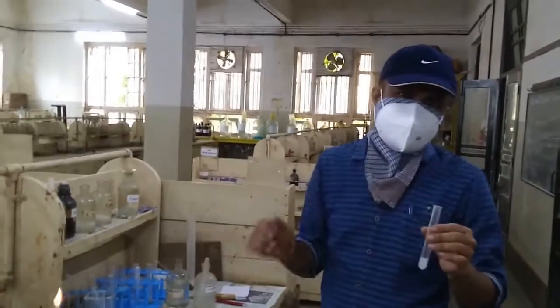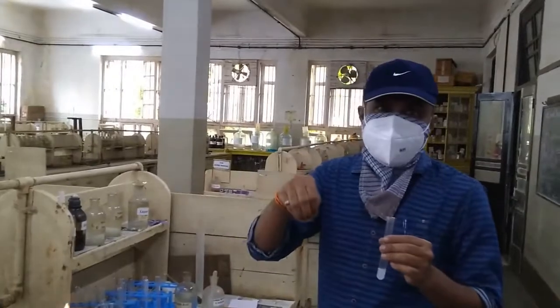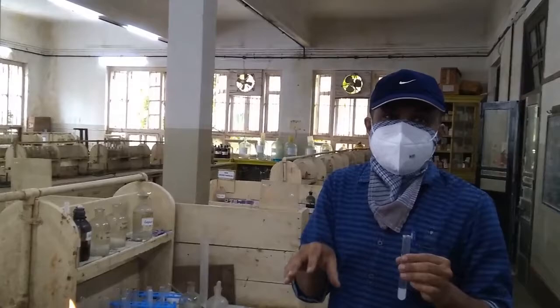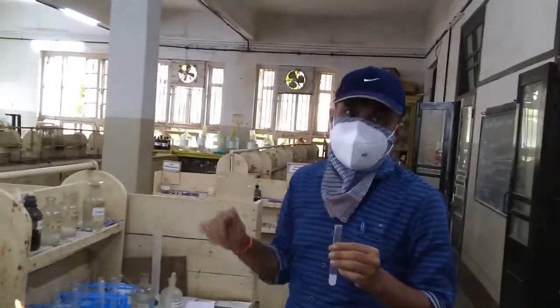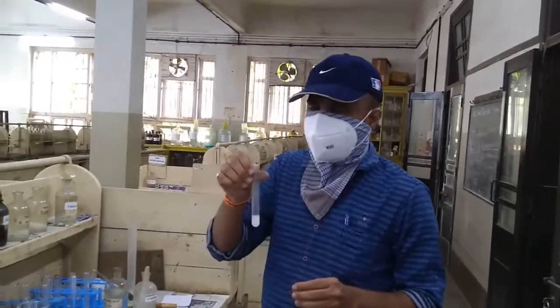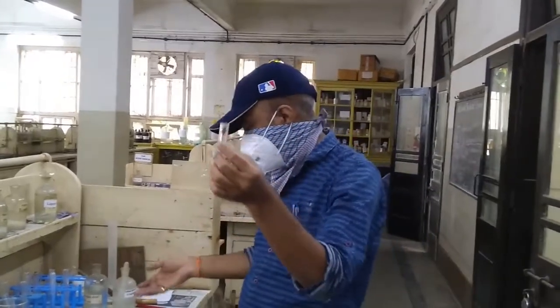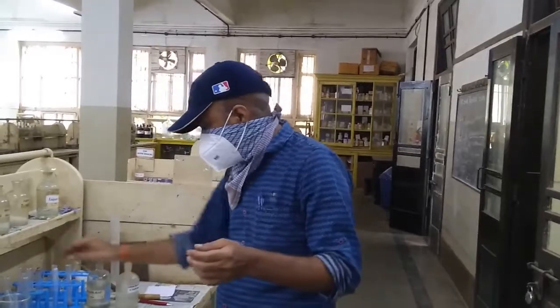The first is original solution plus NaOH, which gives a white precipitate, and on more excess addition of NaOH, the precipitate disappears and the solution becomes transparent. That is called soluble in excess NaOH. Now the second CT we have seen is original solution plus sodium hydrogen phosphate. We get the white precipitate, which secondly confirms that Al3 plus is present. Now let us see the result.